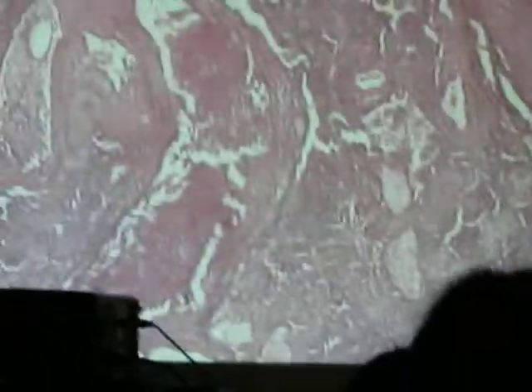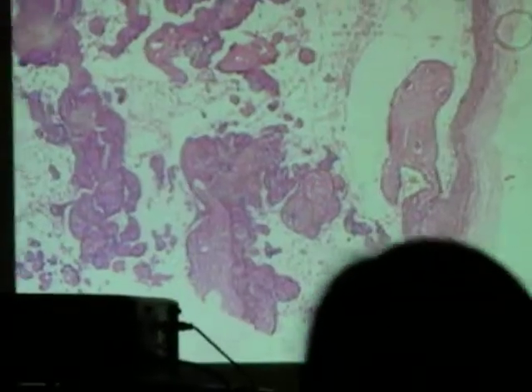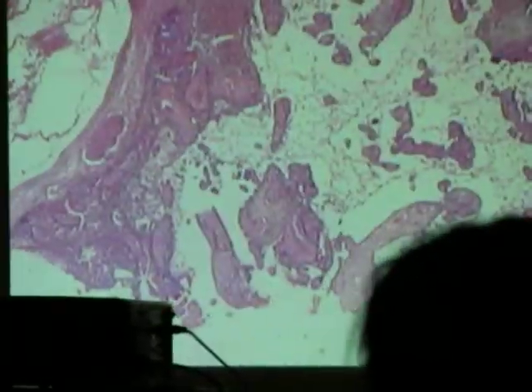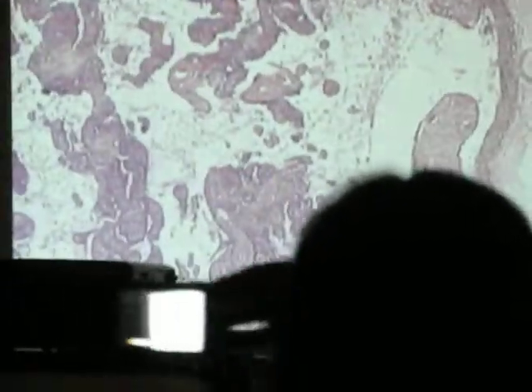So we'll give you a bigger blob to look at than a small blob when we ask it on the actual test. It's a little bit easier. Actually, it's probably the better part of it. You can see exactly what these sections are.